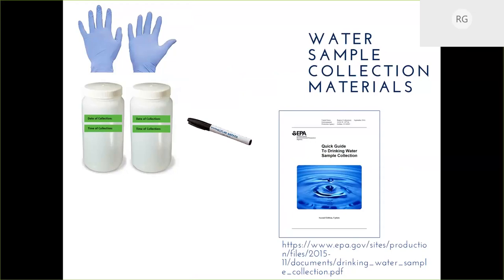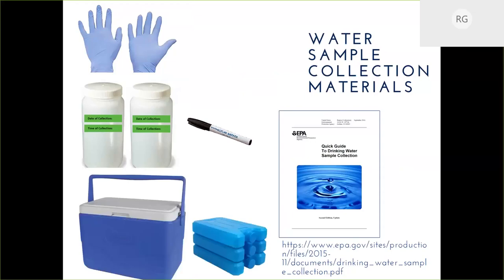It's also important, again, to keep your samples on ice. This is as simple as a cooler that you might already have in your home and ice packs. You just need those samples to be cool enough that bacterial growth isn't happening.